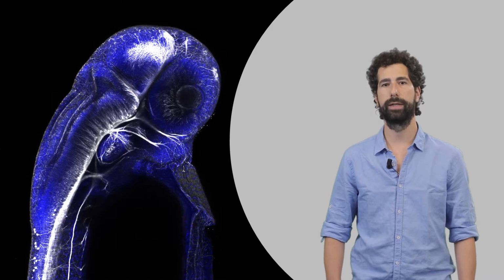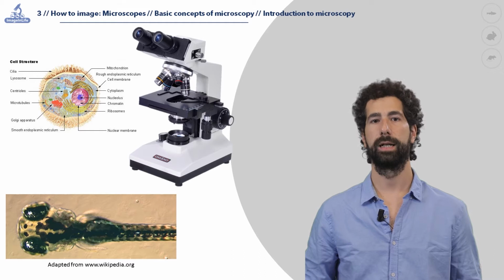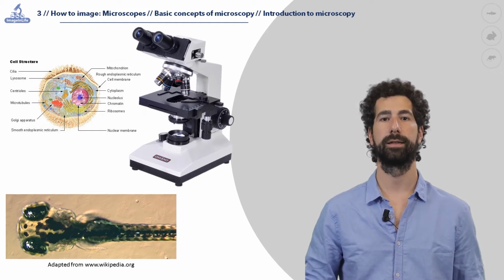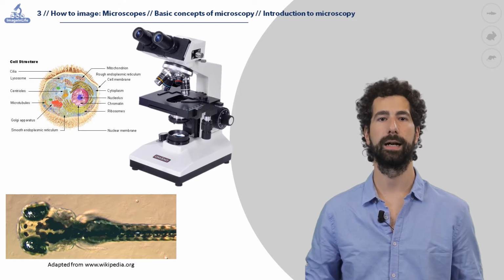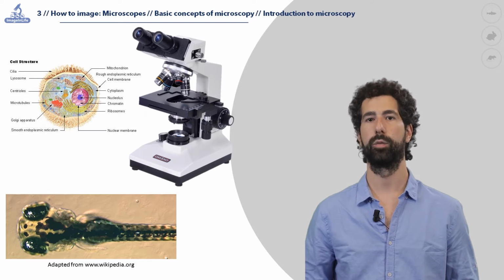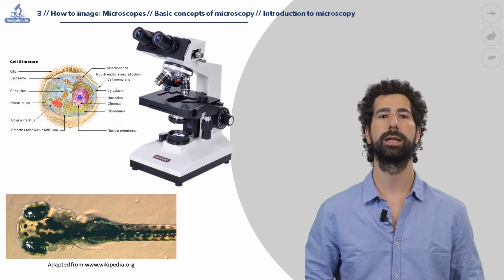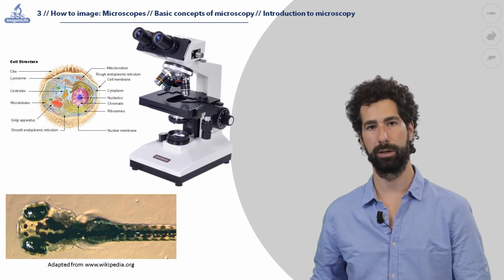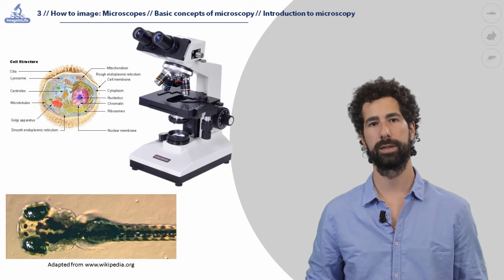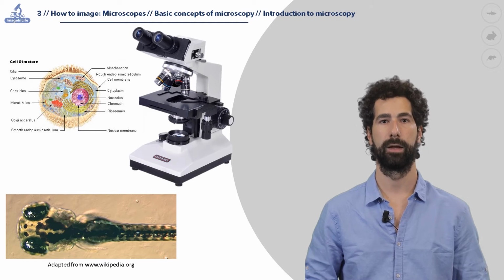In this lecture, I will give you an overview on microscopy. Microscopy is a broad field that, in a very general sense, aims to permit the visualization of objects that are too small to be seen at the naked eye. In this course, we will focus on light microscopy, which refers to the subset of microscopy techniques that use optical elements and the different properties of light to generate a magnified image of the sample of interest, from which will then be possible to extract useful information.